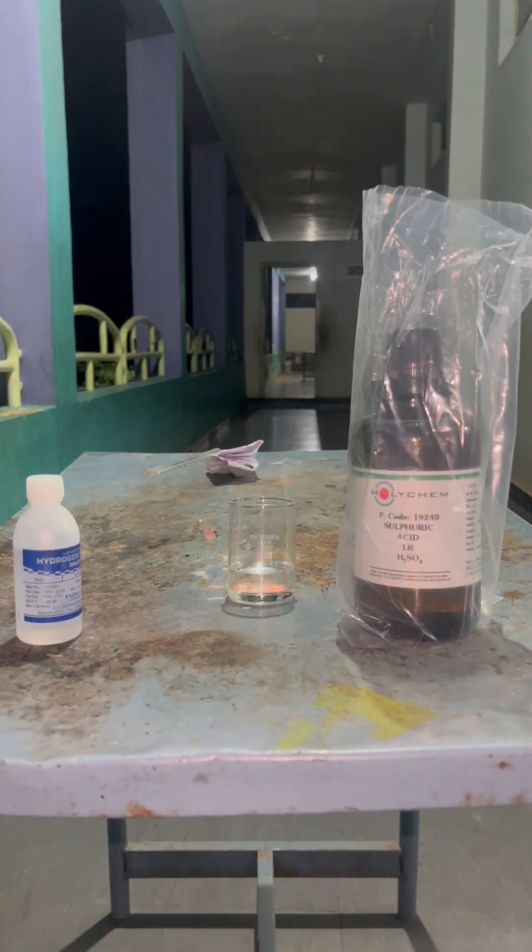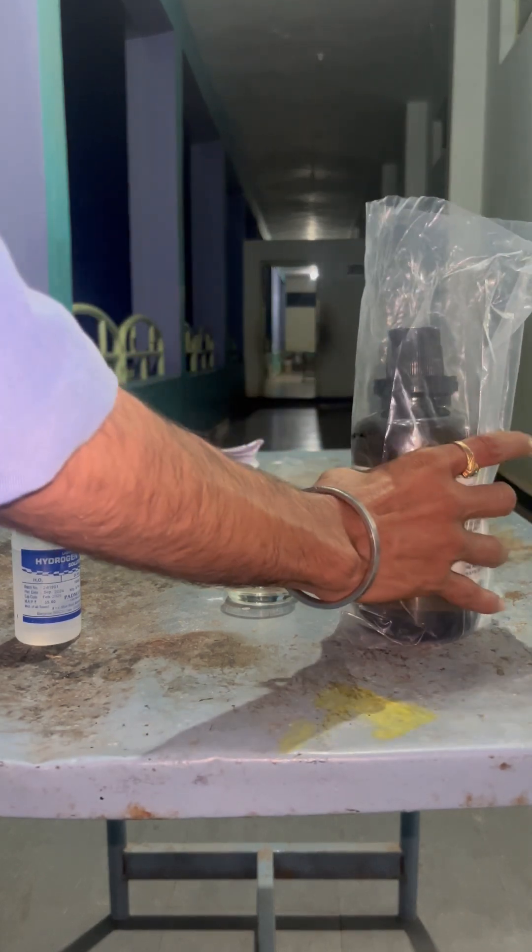Today we are preparing a piranha solution using concentrated sulfuric acid and hydrogen peroxide in a 3:1 ratio. While preparing, we have to use proper personal protective equipment. We have to allow the mixture to cool and stabilize before performing the experiment. Very importantly, we should not prepare a large amount and store it in a bottle — we have to prepare only a very small amount.